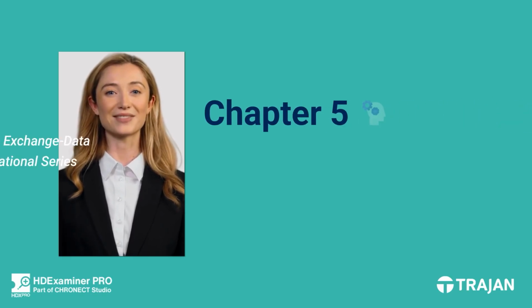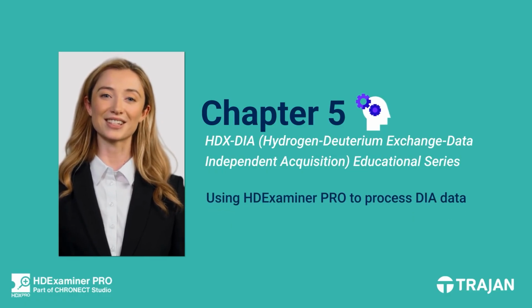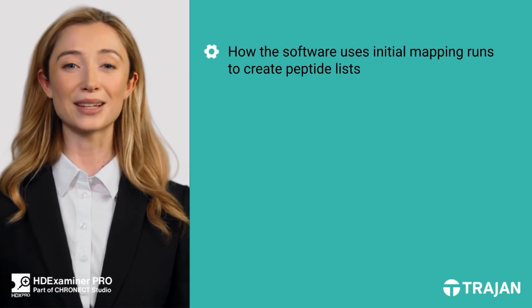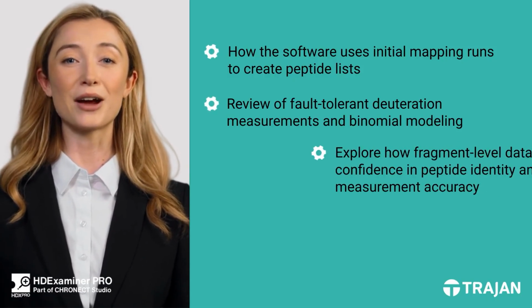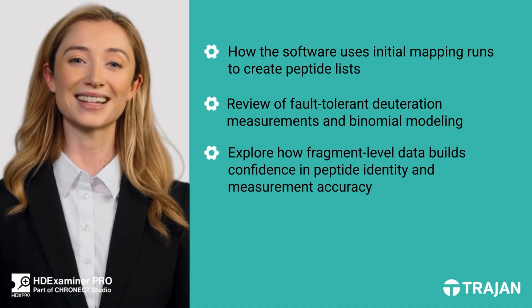Welcome to Chapter 5. In this chapter, we'll focus on how DIA data is processed within the HDExaminer PRO workflow. We'll start with how the software uses initial mapping runs to create peptide lists, then move into fault-tolerant deuteration measurements and binomial modeling. Next, we'll explore how fragment-level data builds confidence in peptide identity and measurement accuracy.